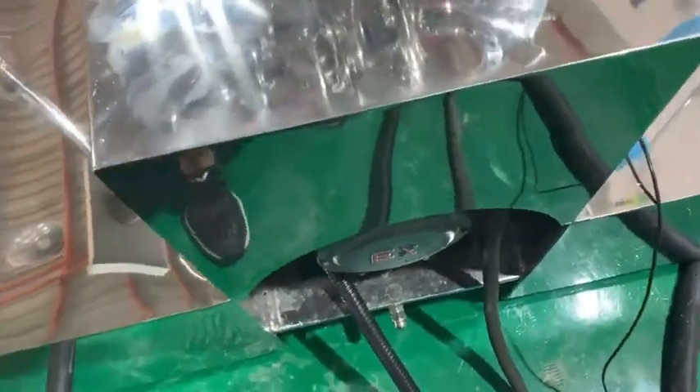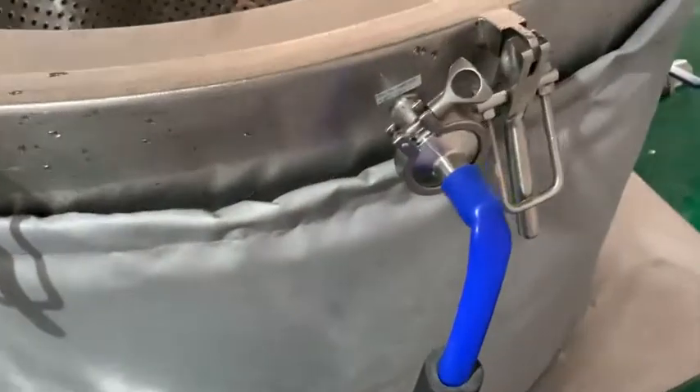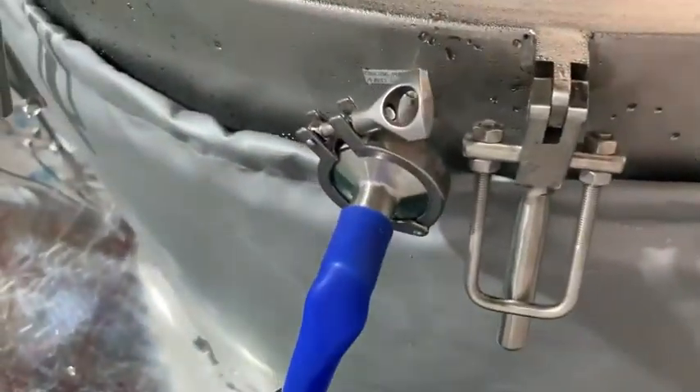And this is an explosion-proof motor. And this is a hot pot.